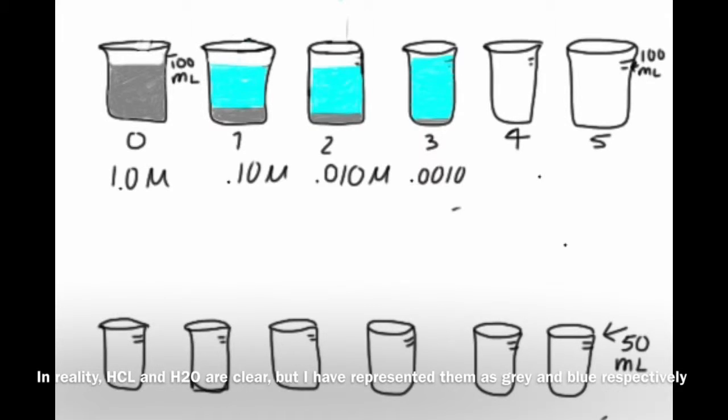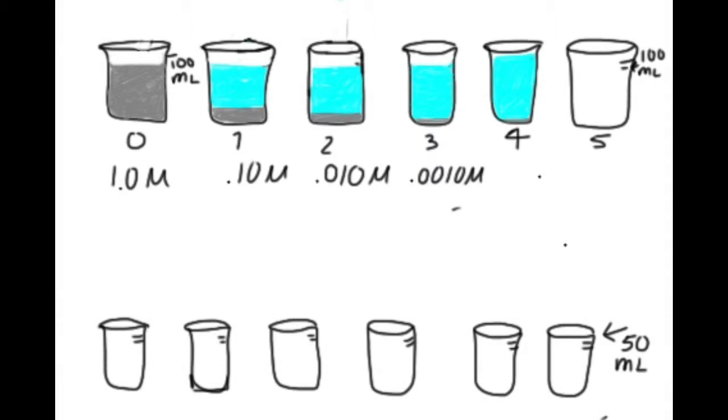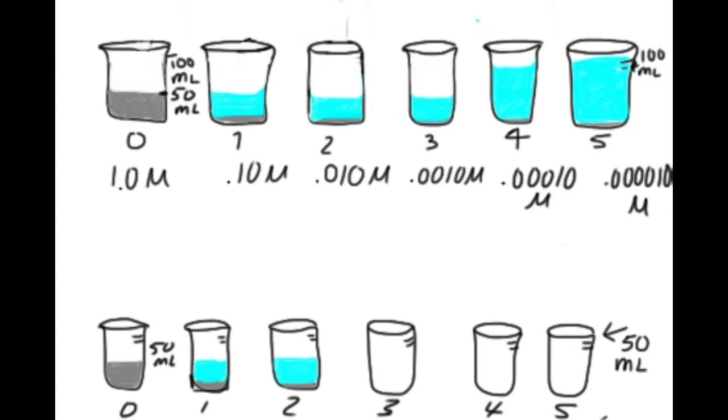Repeat in beakers 3, 4, and 5. Now take half of the solution from the first set of beakers and add it to the second set. Label the second set 0 through 5.